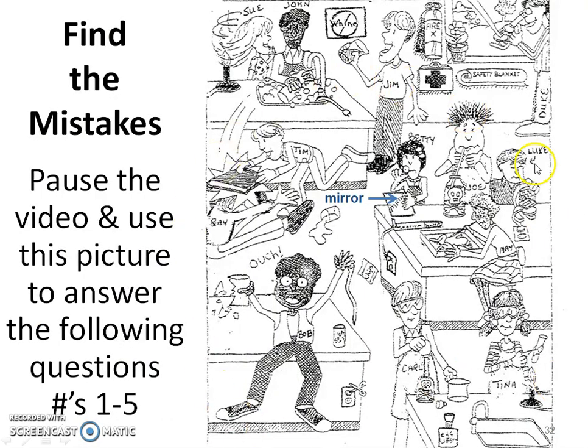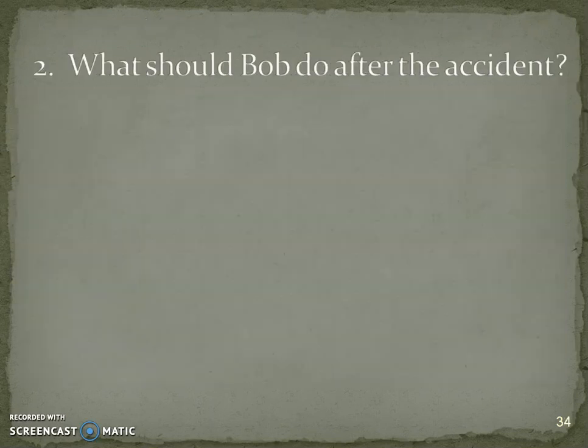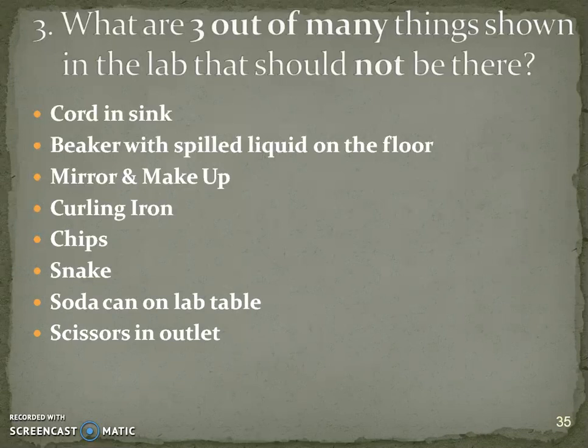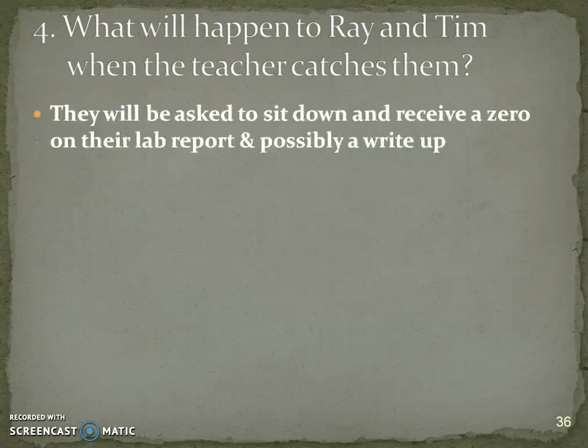Pause the video, look at the picture of Betty at a mirror, and answer questions one through five. For number one, re-read your safety contract to figure out what Sue, John, and Jim are doing unsafely — this chart needs to be fully filled out for credit. Bob after the accident should tell the teacher immediately. There are many unsafe things in the picture; hopefully you found at least three. Ray and Tim will be asked to sit down, receive a zero, and possibly a write-up.